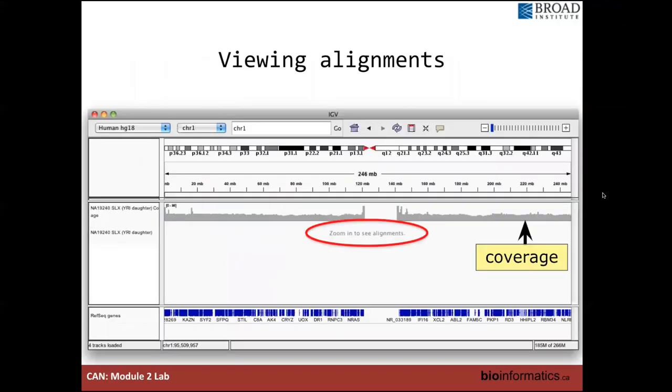Once your file is loaded, if you're loading a BAM file, you'll see a coverage track as well pop up for each BAM file that you load. And this shows how many reads are covering any particular region that you're looking into. And you're going to have to zoom in to see the actual alignments. This is because BAM files can be extremely large, contain several gigabytes of data, and trying to load that all at once onto your computer is going to absolutely freeze and cause problems.